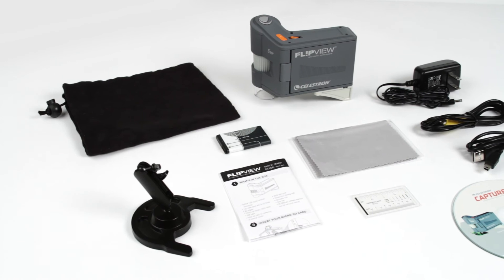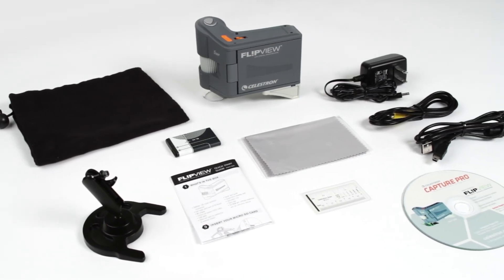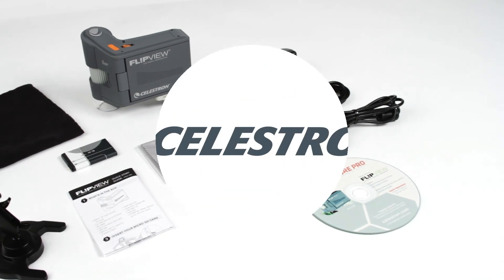The FlipView microscope includes a drawstring carry bag for easy transport, lens cleaning cloth, calibration ruler, USB cable, video-out cable, software CD, and AC power adapter.